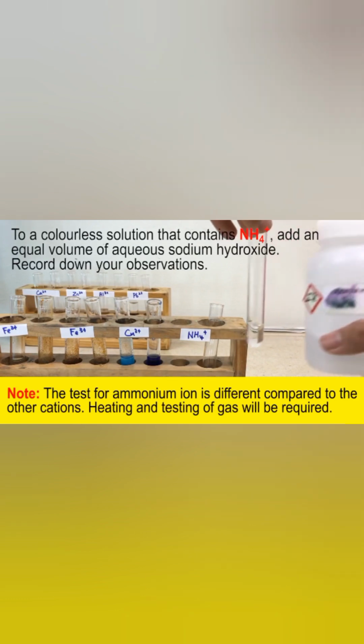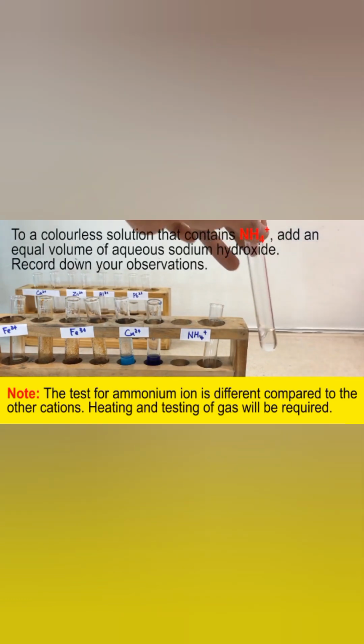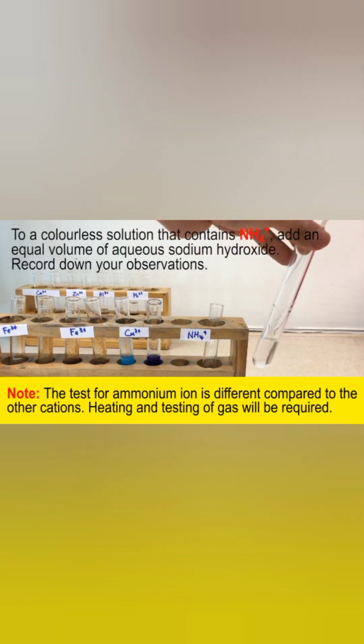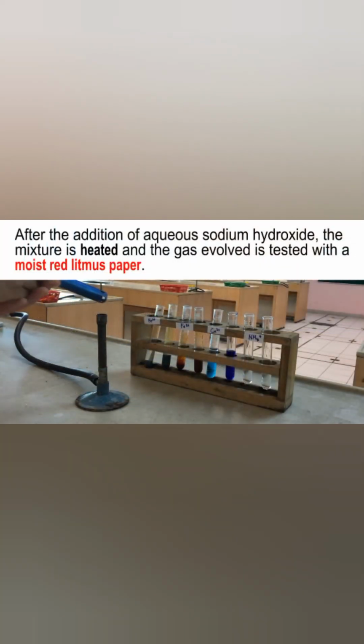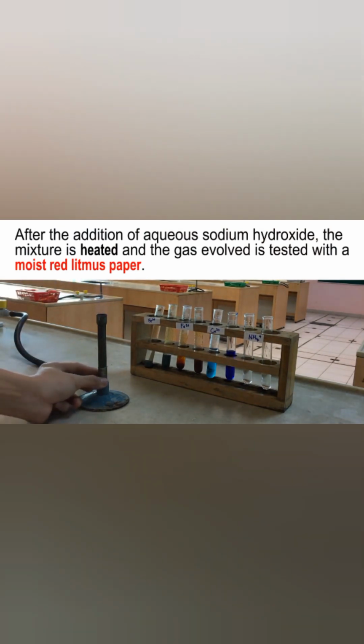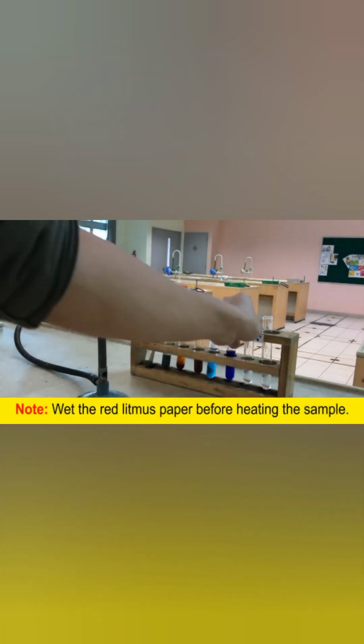The test for ammonium is different compared to the other cations. If you add sodium hydroxide, there is no visible reaction. After the addition of sodium hydroxide, the mixture is heated and the gas evolved is tested with a moist red litmus paper. So you're going to apply heat for ammonium.